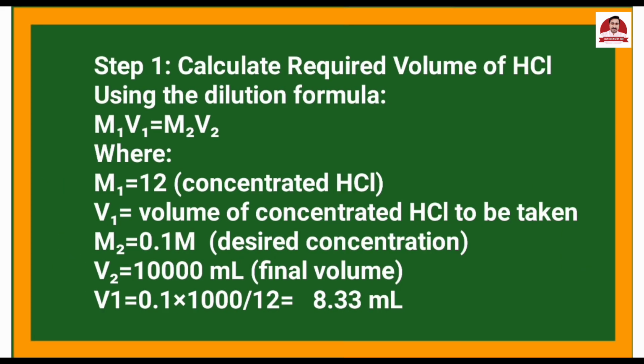Next we will discuss its method of preparation step by step.